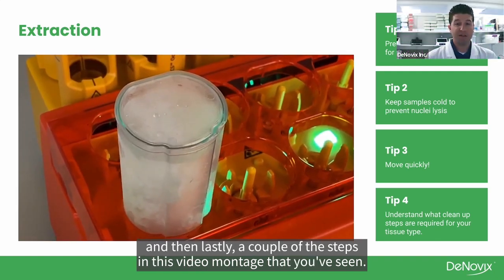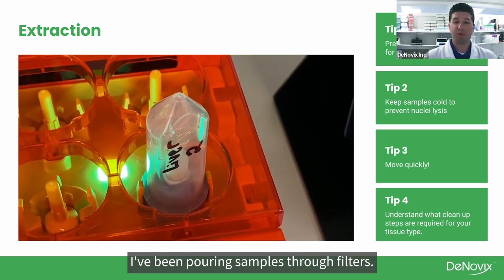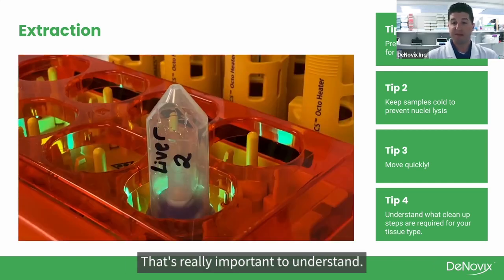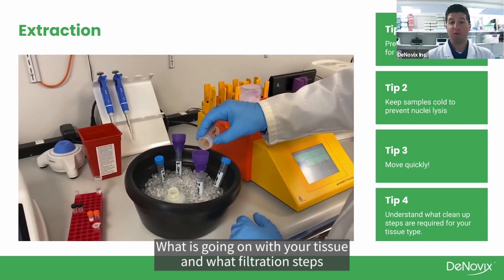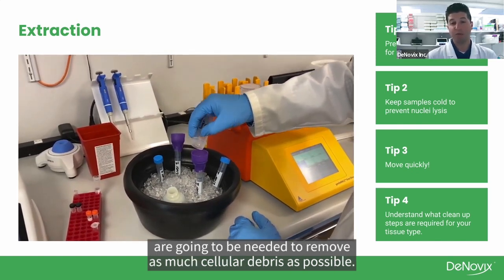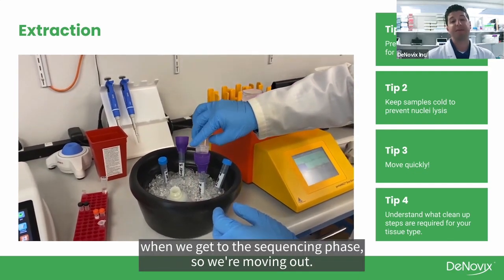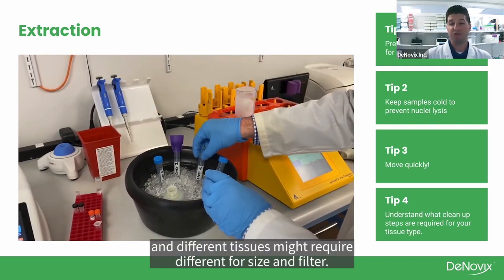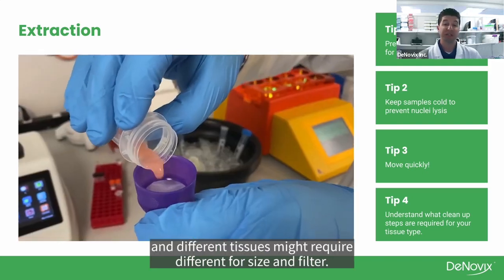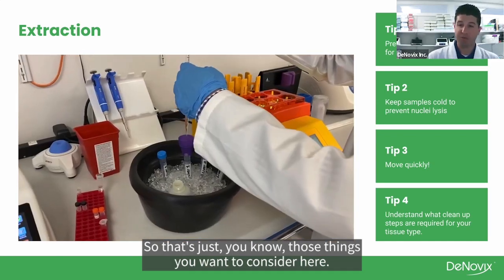And then lastly, in a couple of the steps in this video montage that you've seen, I've been pouring samples through filters. It's really important to understand what is going on with your tissue and what filtration steps are going to be needed to remove as much cellular debris as possible. We don't want a lot of debris when we get to the sequencing phase, so removing that debris beforehand is important. And different tissues might require a different pore size on the filter. Those are things you want to consider here.